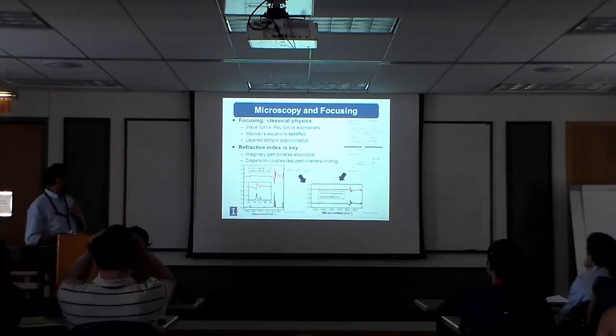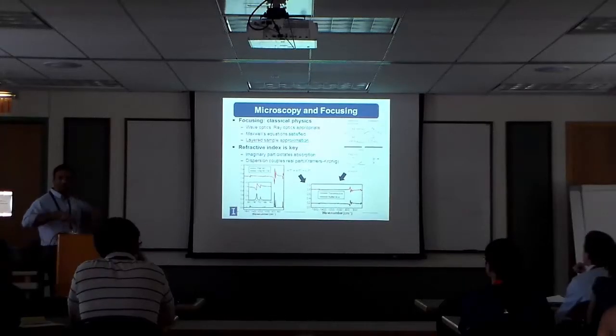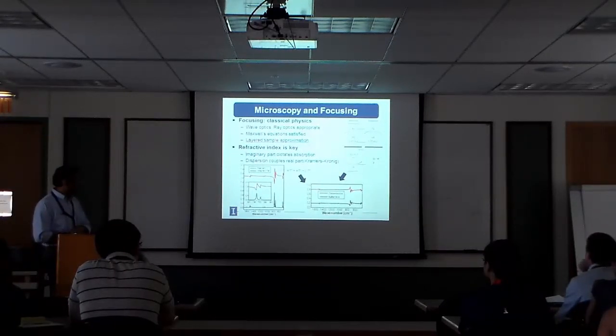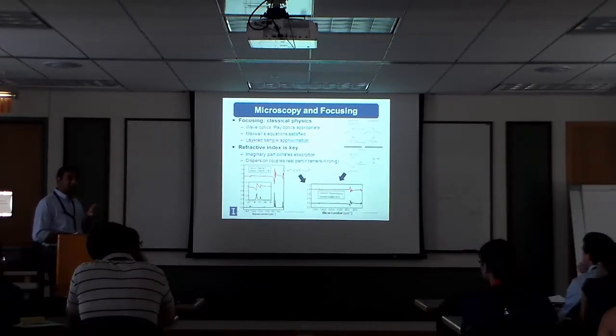The only interesting point, which again, stop me if you've heard this before, is that what we are interested in is the absorbance here, right? We're interested in these sharp lines. It's a symmetrical wave sort of form around this band. And it's the imaginary part of the refractive index. That's what the absorbance depends on. Right? Unfortunately, it turns out that the imaginary and the real part of the refractive index are related. And in the mid-infrared, you get this sort of anomalous dispersion idea where you have very rapid, almost violent changes in the real part of the refractive index when your absorbance is at the maximum.